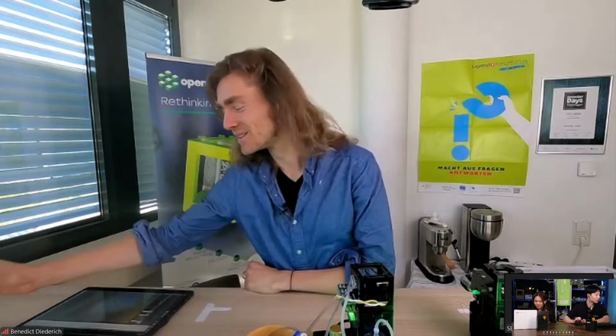So does that help us to pick the next one? Okay, let me check. Wait a moment. Wow, there's tons of comments here. I can find one out here. Okay, it's one question from David: does the microscope come with the NeoPixel cube in the box, or do you have to illuminate your samples via a flashlight or torch?